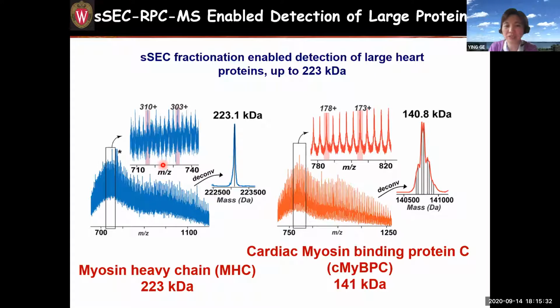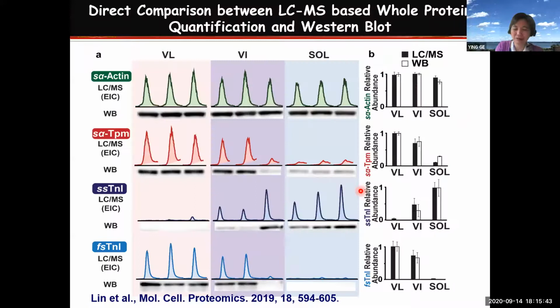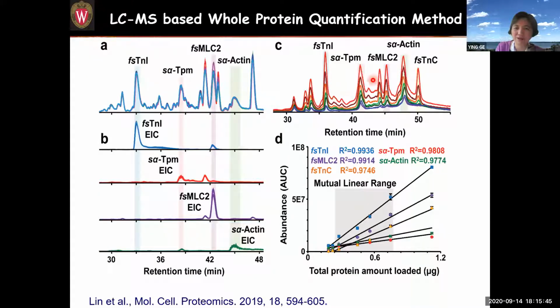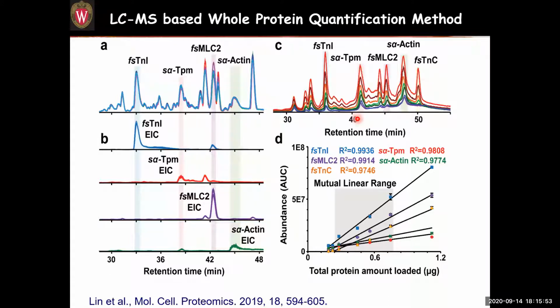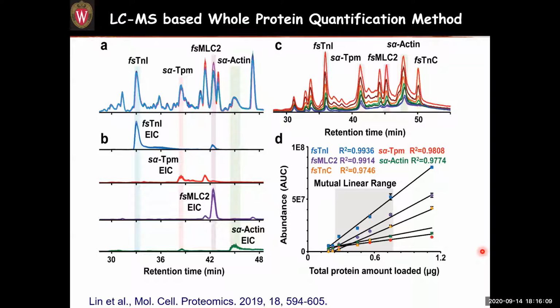Sanjeev, these data all come from Maxis. Okay, thank you. These are not from FT. Okay. And all these data are actually from Impact 2. We found Impact 2 is even more reproducible. The biology students in my group all love the Impact 2 because it's much more robust, and it can provide linear quantitation. Very interesting. Thank you.